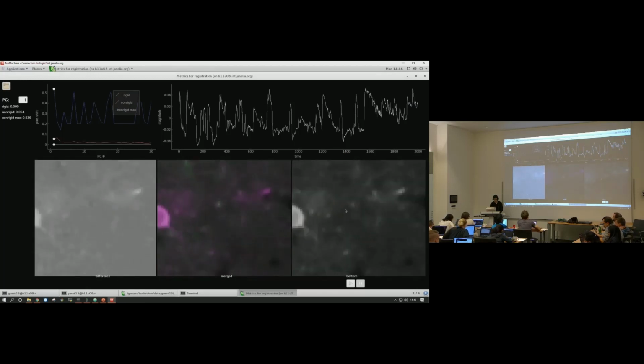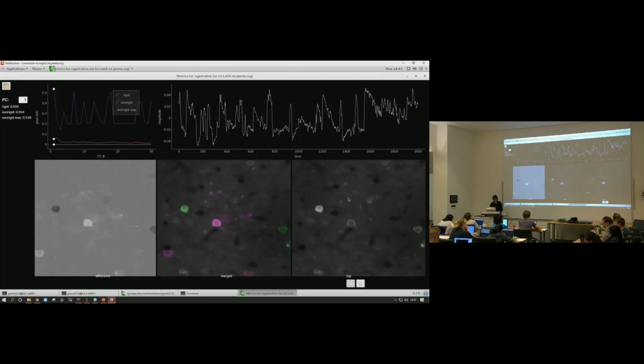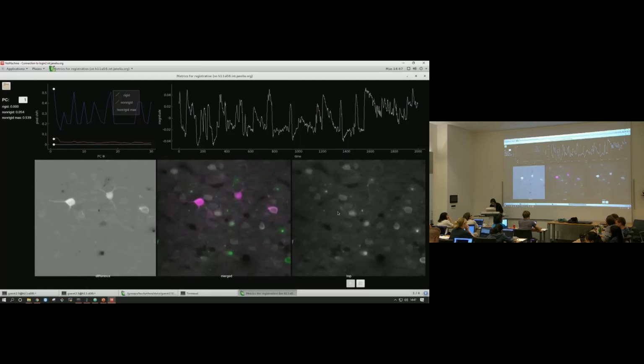So I can zoom in a little more maybe to try to see a little better what's going on. All right, I'm zoomed in too much, but zoom is very difficult to control. But for the most part, this looks like activity. This doesn't look too much like shifting, but I have to stare at it. So you would look at a medium bright cell, one with average intensity, that's still always on, and then it looks like it's not changing.